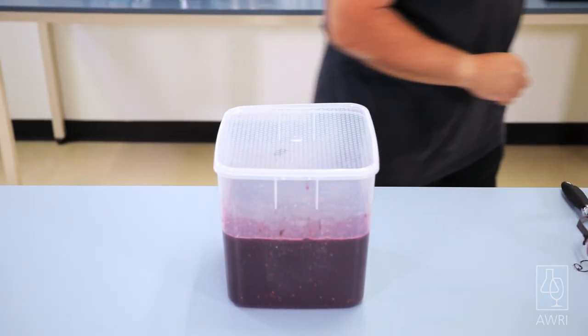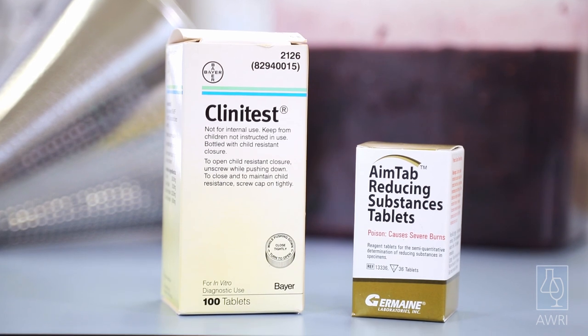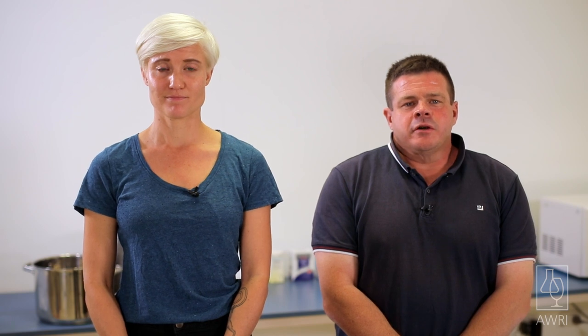On day five, test the liquid for residual sugar to check if the ferment has finished. Aim Tab or Clinitest strips are available from brewing shops. If the sugar test reads two grams per litre of sugar or less, proceed to drain and press. If the test shows a higher result, leave the ferment for an extra day, recheck the sugar, and repeat if necessary — but regardless of the outcome, press the ferment by day seven.